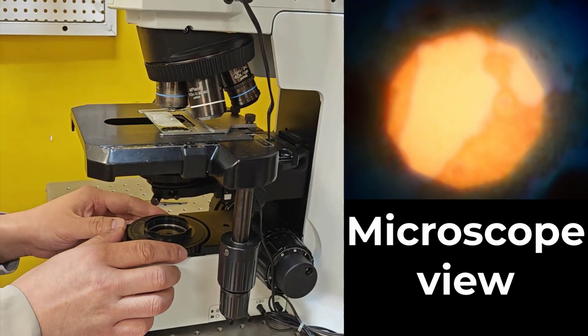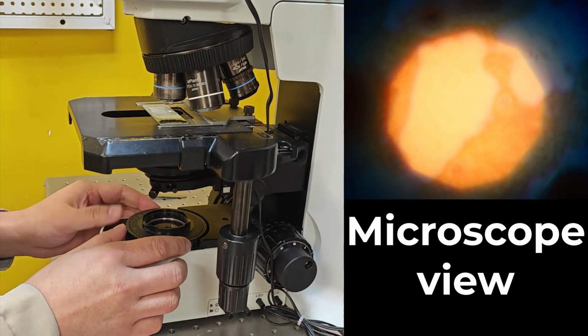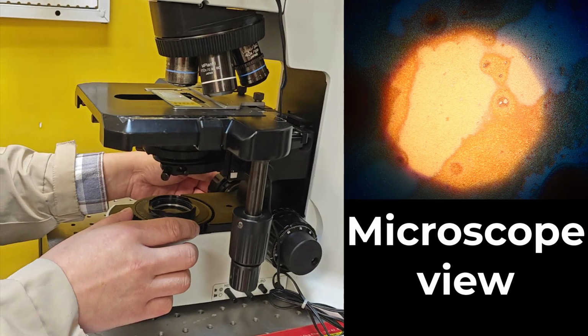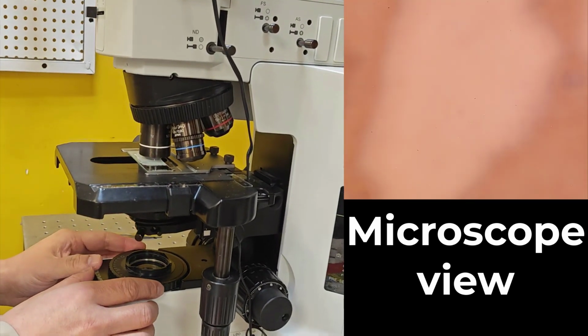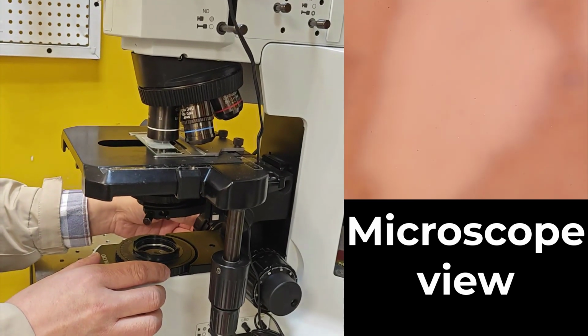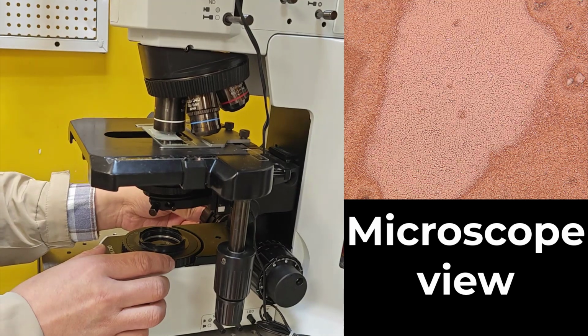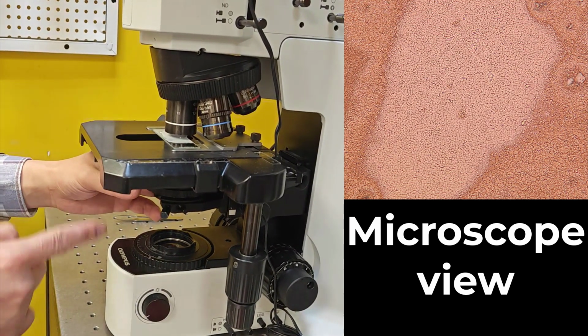Once it's centered, you can focus your sample and adjust the bottom aperture so the illumination just covers the field of view. Then you can switch to the magnification you want. After refocusing the sample, you can see the sample image is much cleaner and sharper.